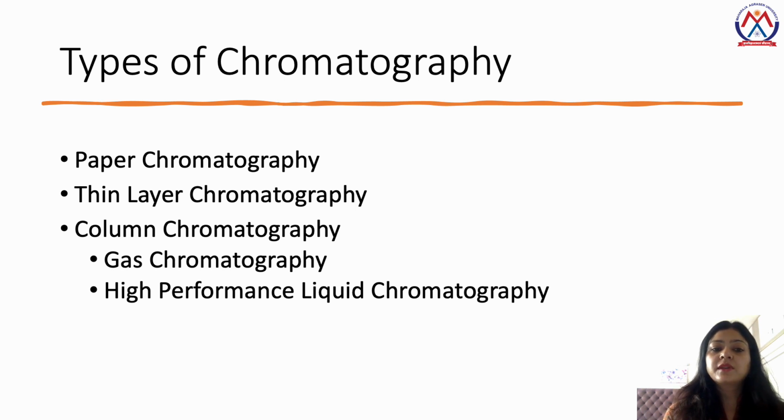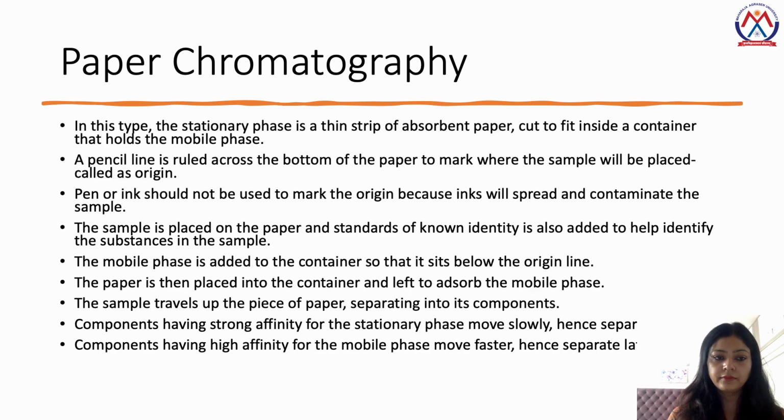There are various types of chromatography such as paper chromatography, thin layer chromatography, column chromatography. Column chromatography is further divided into gas chromatography and high performance liquid chromatography. First of all, we will discuss about paper chromatography.